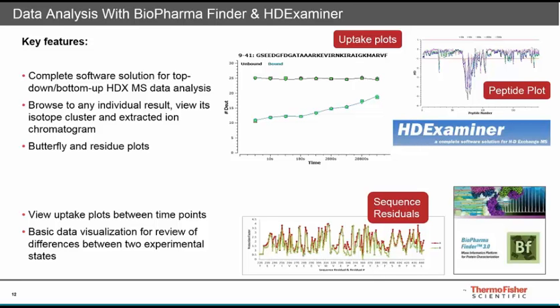It also includes an HDX model that simulates the hydrogen-deuterium exchange and back exchange process at a single residue level. It provides also deuterium uptake plots for the individual peptides and also protection factor plots that are shown here in the picture. What's shown here is the comparison of two samples in the sequence residuals representation. This type of plot can be used to evaluate the protein's conformational property.